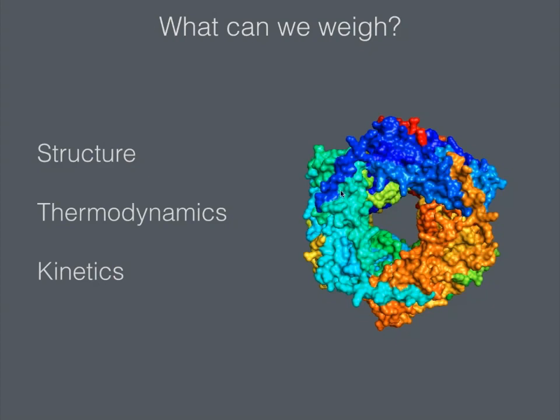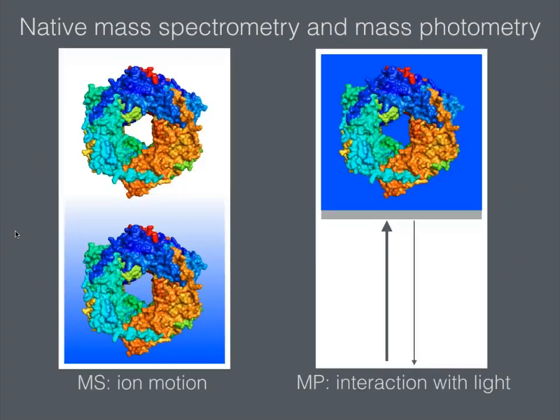So I'm going to try and illustrate how, just by measuring mass and measuring those subcomponents of this oligomer, we can reconstitute the structure to a certain extent, and understand ultimately what governs the assembly of these proteins. And I'm going to try and do that in a quantitative way, so talk about the biophysics that underpin that structure.